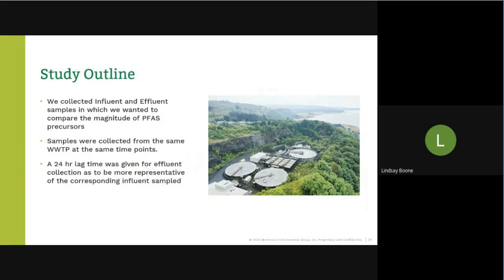So what we did in this particular study was we collected influent and effluent samples where we wanted to compare the magnitude of the PFAS precursors. Samples were taken from the same wastewater treatment plant at the same time points. We allowed for a 24-hour lag time between influent and effluent because there was about a 24-hour lag time, for example, if you're trying to follow that same drop of water through the treatment process. So we collected the effluent 24 hours after we collected the influent.